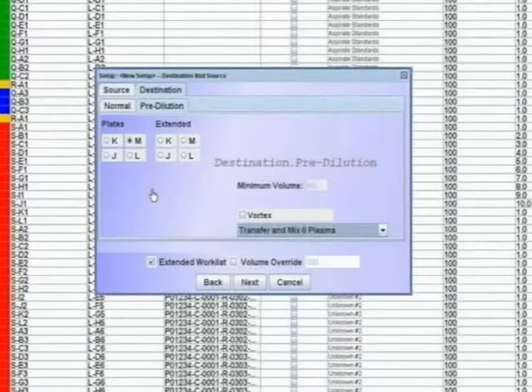If the formatter is equipped with a cold nest, it must be on station J. It is suggested that L and J be used for destination plates. Station M be used for pre-dilution, leaving Station K available for inputting the standards and QC samples when desired.